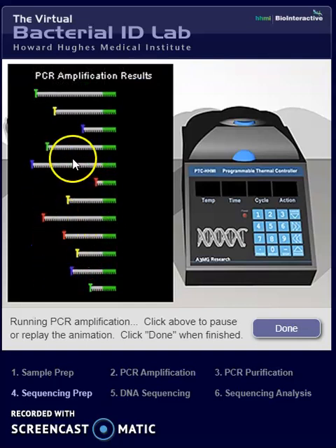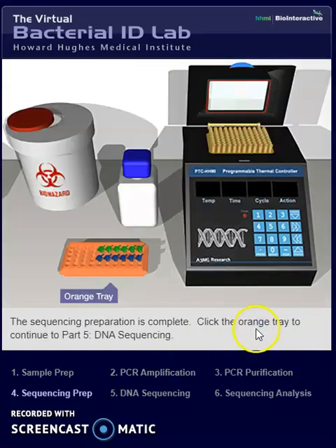This is the result for the PCR amplification. The sequencing preparation is complete.